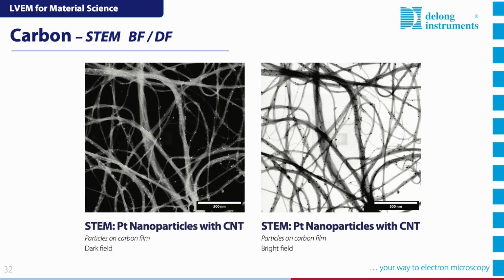Here are some more images of the same material, both in dark field and bright field, again highlighting the position of the organic material in relation to the inorganic.